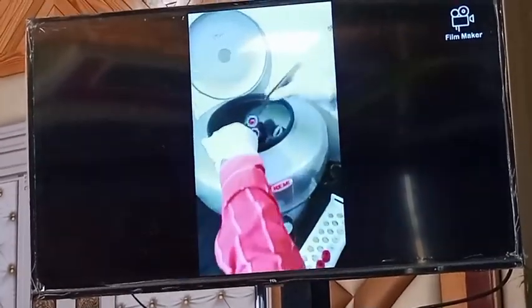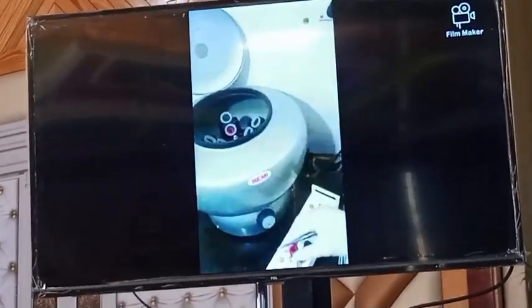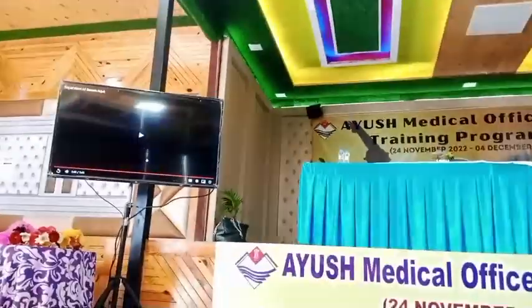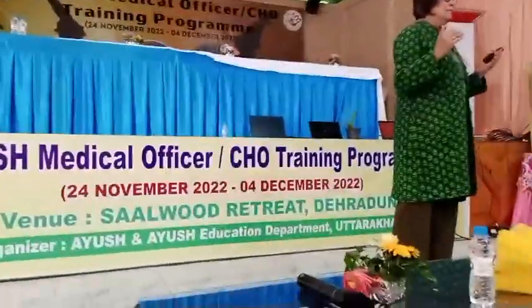Otherwise it may happen that today I think I am taking 100 microlitres, but the pipette has gone bad and I say I took 100 microlitres, but it actually takes 50 microlitres, so my test will be wrong again. I'm giving erroneous results. So for that matter, all our instruments are calibrated. When you look at pathology, it is very scientific and every step is calibrated. Like we say, we run controls, we calibrate instruments, we do PMs of the instruments, everything is calibrated.